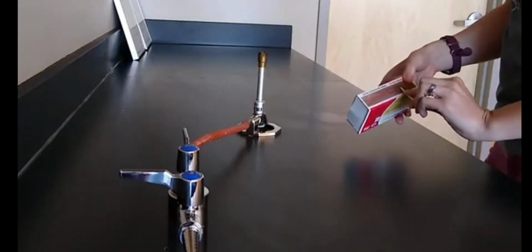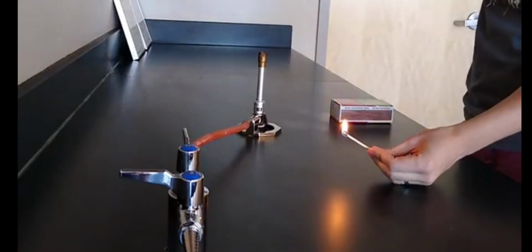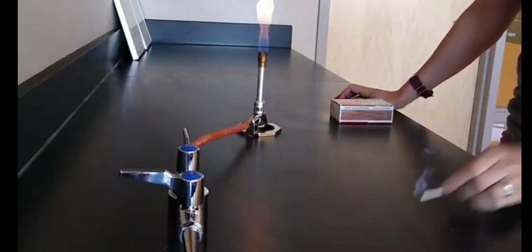Light our match, and we're going to bring it up from the bottom because there's a cloud of gas accumulating right here, and I don't want my hand in that cloud of gas when it bursts into flames. Okay, blow out our match.